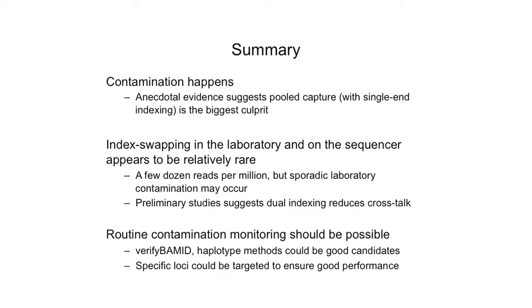And I think this mainly happens because after capture, you do an amplification step, and you get incomplete extension of the products. One molecule is priming off another molecule, and you get chimeric species. We have experiments to try to test this, but I'm pretty sure that's at least participating in that phenomenon. We did do these experiments with M13, which suggests that on the clinical side, index swapping, both in the laboratory and on the sequencer, is really rare, and I wouldn't expect it to influence clinical calls.